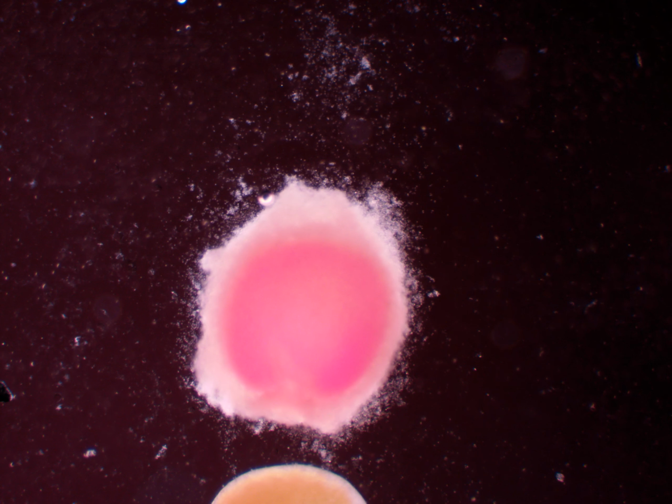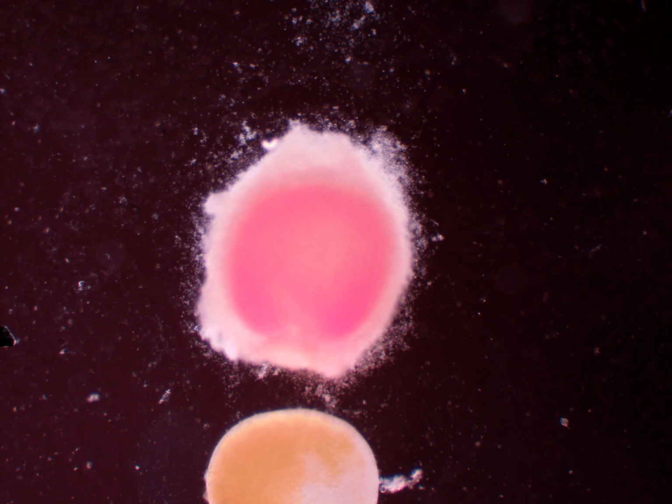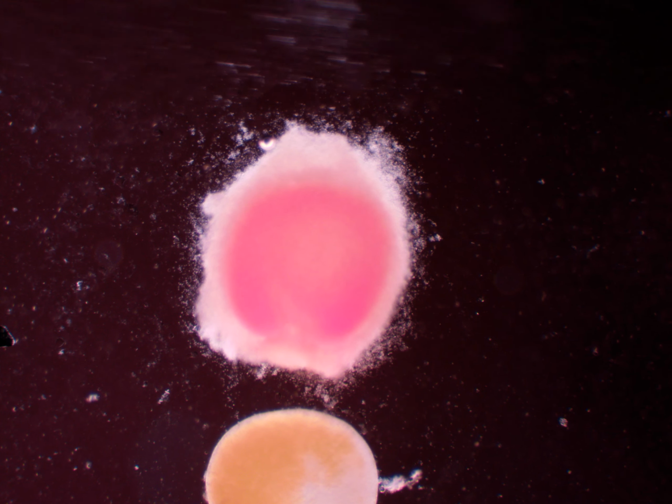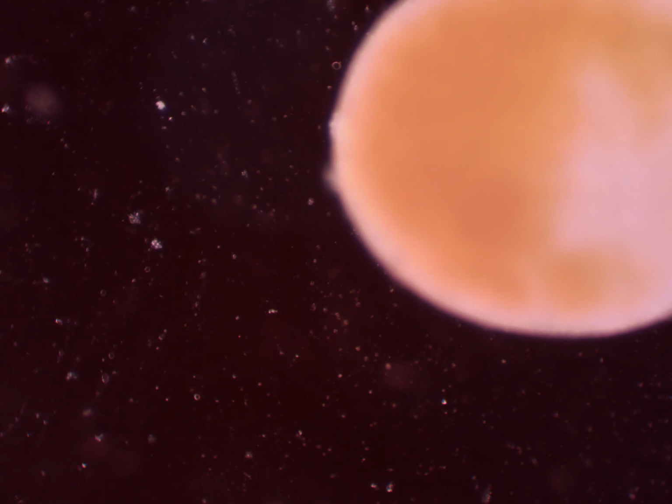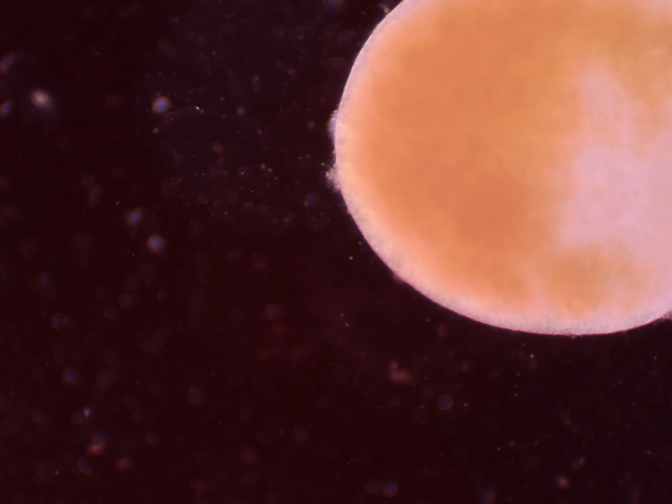Hello, this is an older video of mine I couldn't post at the time, but these are two Copepodite eggs. I believe they're both from calanoids, and what you can see there is a bunch of bacteria that was trying to attack these eggs and extract what's inside of them.